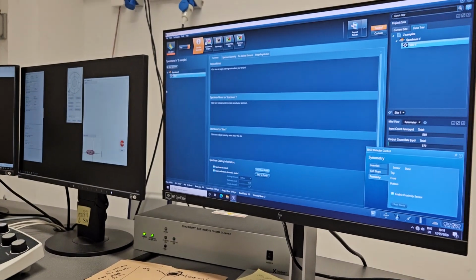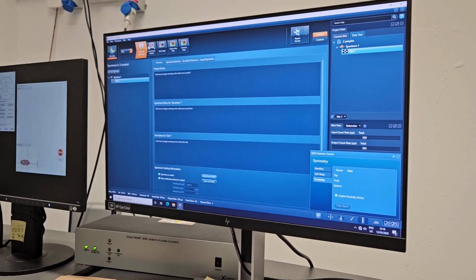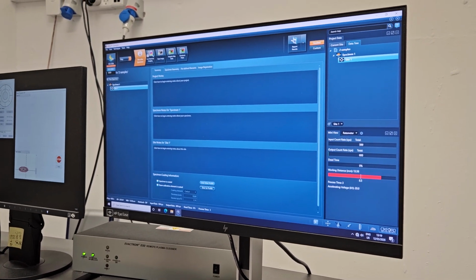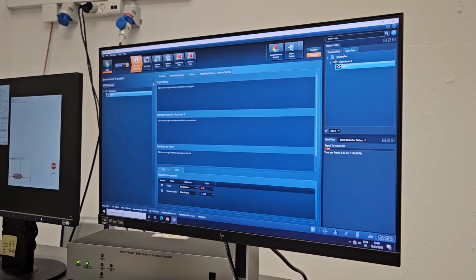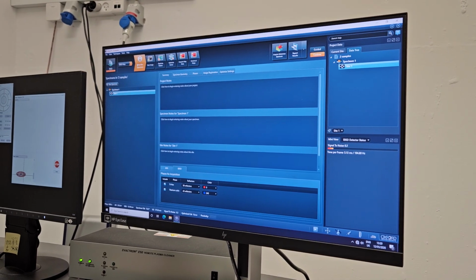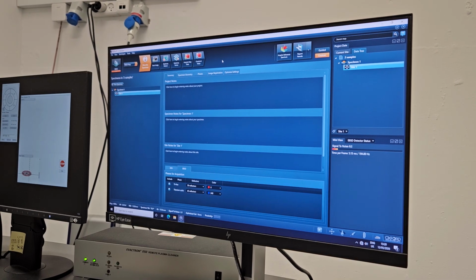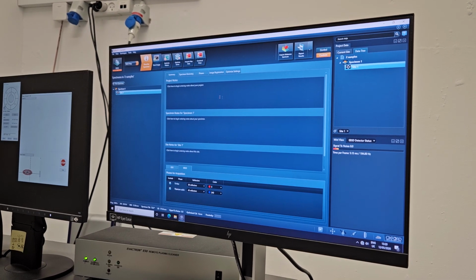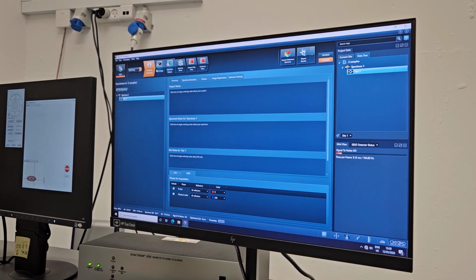It looks bad. So here somebody before us used the EDS system. We need to change to the EBSD system, and the idea is the same. You start from here and end up here. Scan. So definitely it's not titanium.